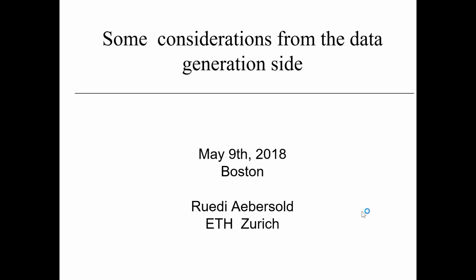This whole course is about, well, this capstone is about data analysis of, as Brendan said, DIA or SWATH data, and I will talk for a while about some considerations of this data. There are various points; I'm coming to them.